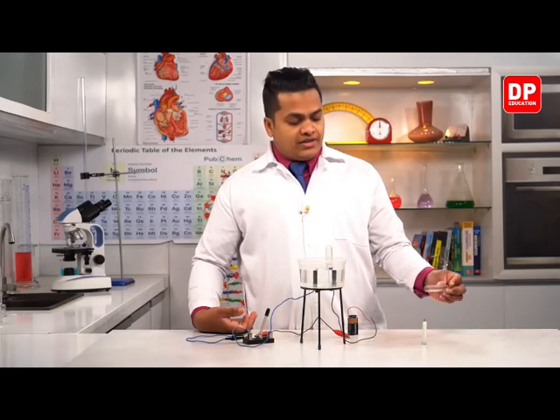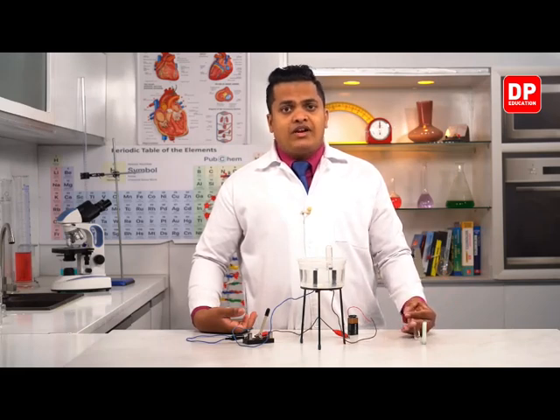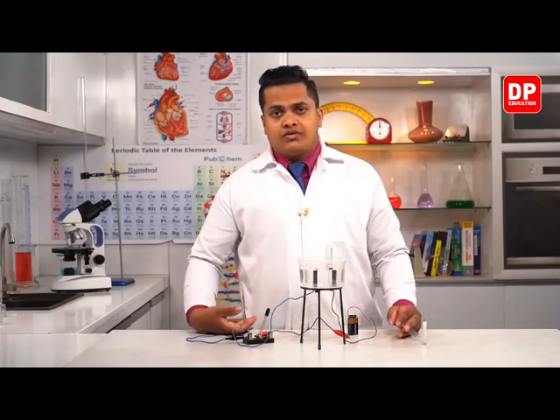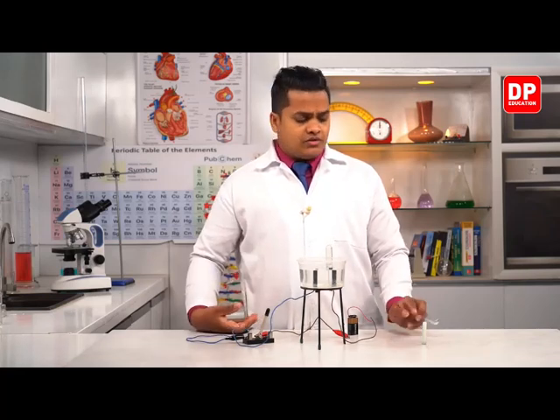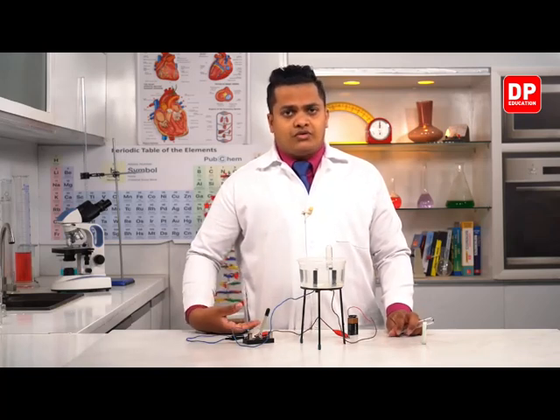So upon inserting this combustible gas into a splinter or else to a flame, what will happen? The hydrogen gas is going to light up, and because of that process, it's going to combust. So because of that process, my dear children, it's going to emit a pop sound, and also due to that thrust, the flame is going to put off.